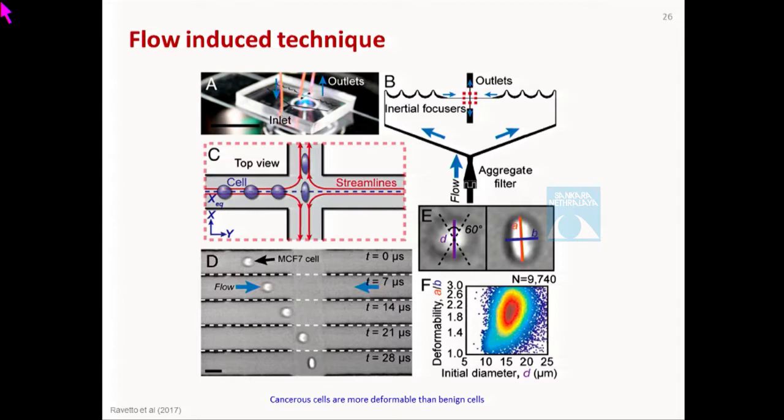People have also subjected cells to just shear stress at a junction. These cells are flown in, and you have some liquid also coming from the opposite direction. Here you can see the spherical MCF7 cells as it comes and tries to bend 90 degrees. So you have some additional flow coming, and that leads to deformation of the cell because of excessive shear.